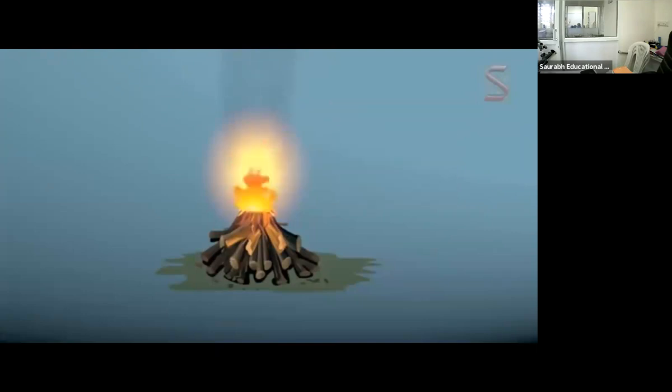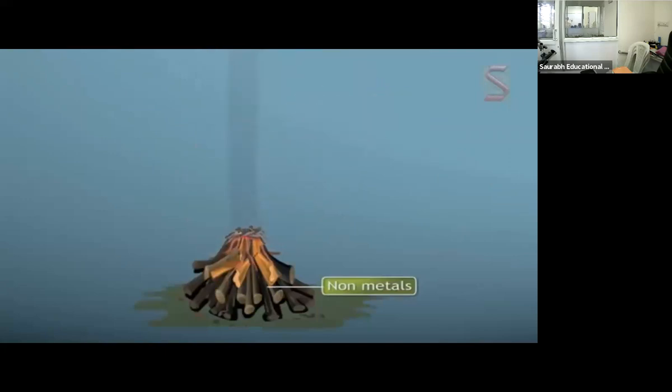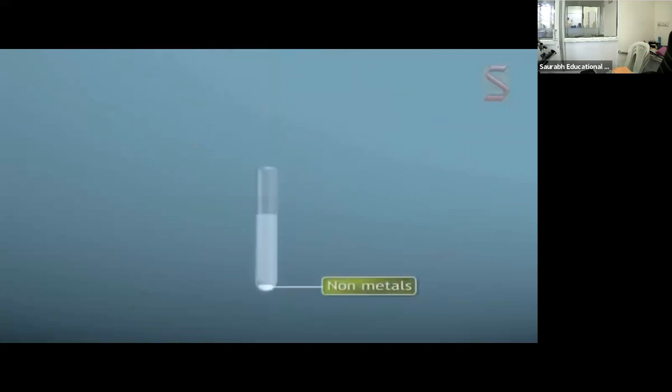We don't need the fire anymore. Let's put it out. The fire is gone, but the unburned charcoal is left behind. That's true. Generally, nonmetals do not react with water, though they may be very reactive in air. Such nonmetals are stored in water.